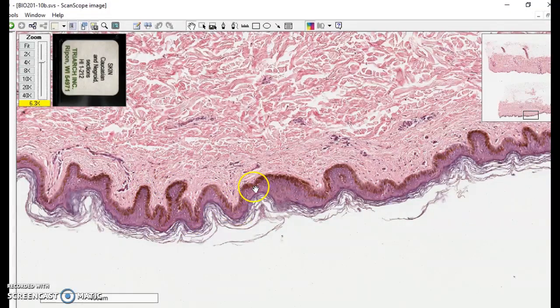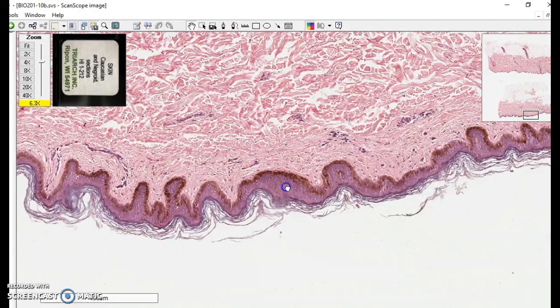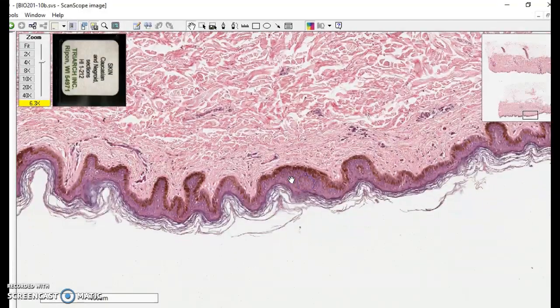are closely adherent. There's no matrix, there are no blood vessels, so that in itself tells you it's an epithelial layer. It's more than just a single cell, and we'll see a single cell layer, so we'll see that when we get closer. And then it has a surface, the apical surface, that faces the skin, the body surface, in this case in skin. So up in here we notice dense irregular connective tissue.